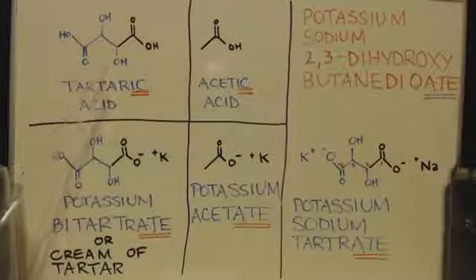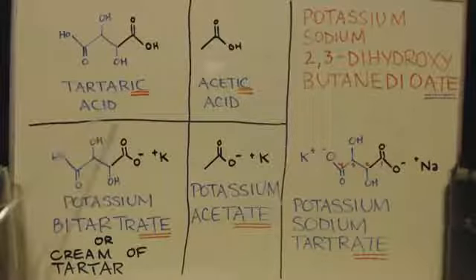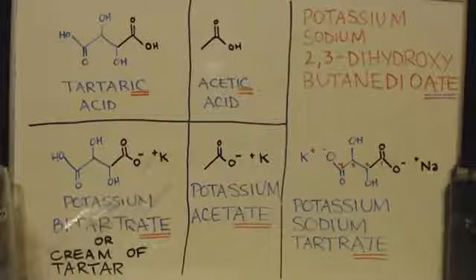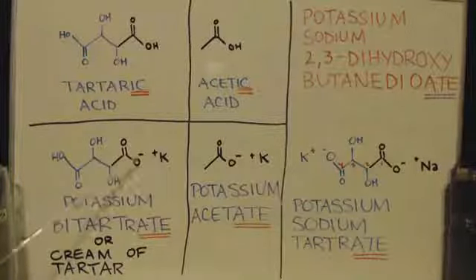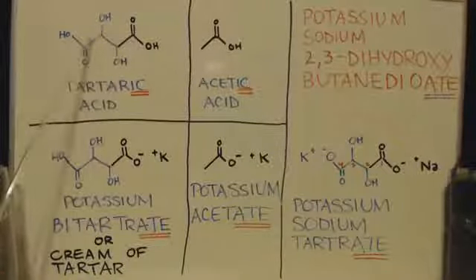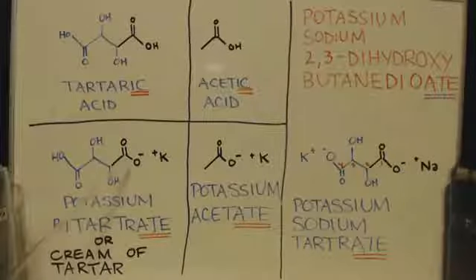And this is called tartaric acid. See, -ic. And when I put some potassium or sodium carbonate or bicarbonate in there, it will take the first, as you can see, there's two sides here where it actually has a carboxylic acid. So it will make the potassium bitartrate, and bi because it's only done one side. This is actually the cream of tartar that we bought. Okay, this is the cream of tartar.